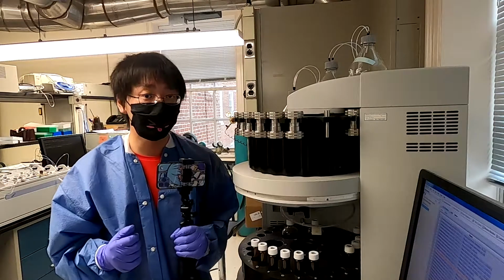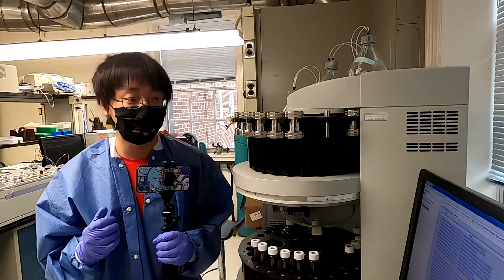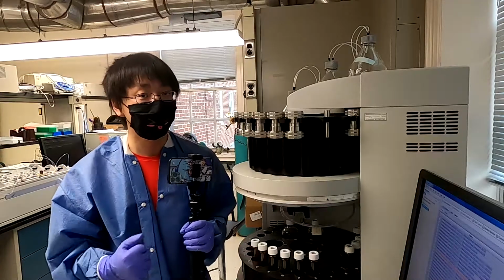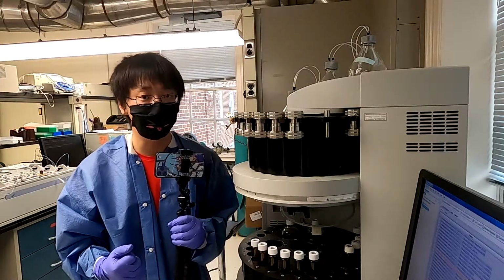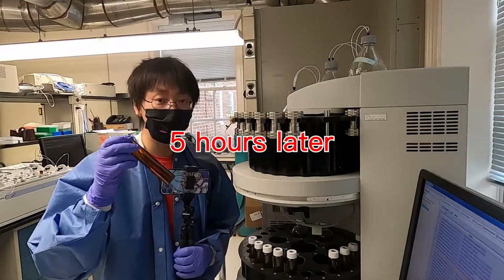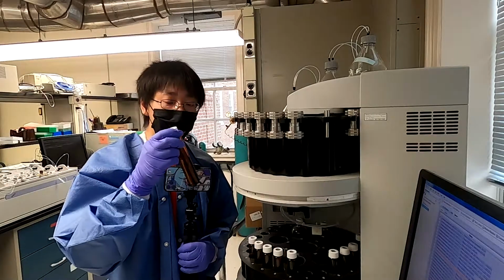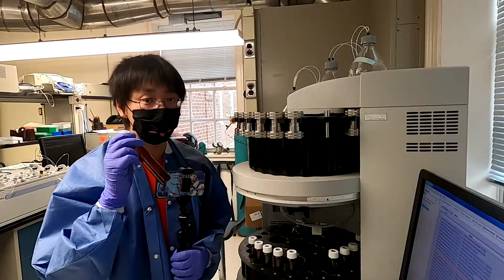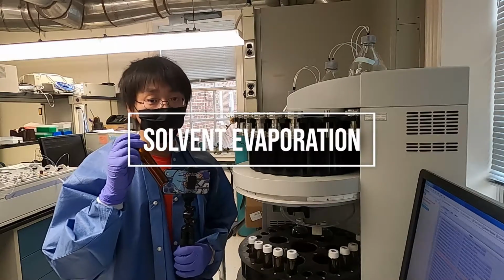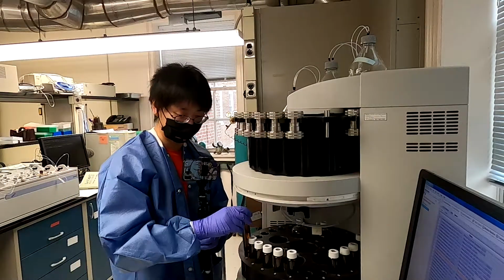So for each of the extractions, it will take about 45 minutes. And so let's wait for 5 hours and then go back to check our extraction. So now it is after 5 hours, and we can see that we have some of the extract in our vial. And the next step is to evaporate the solvent so that we can concentrate the DDT samples.